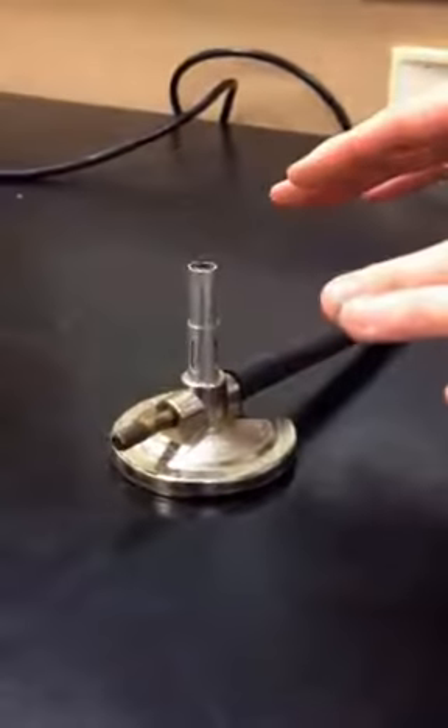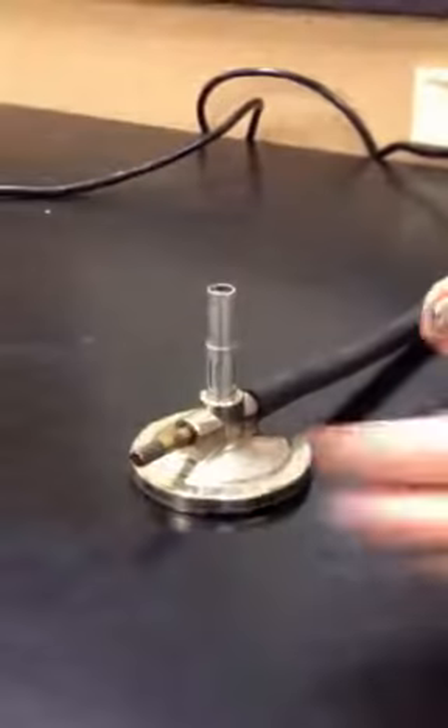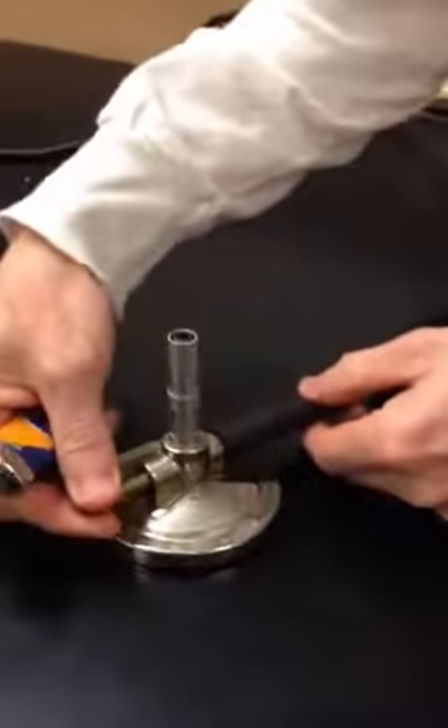When you're using your Bunsen burner, turn it on on the side and listen for gas coming out. If gas comes out, use the on-off knob to go on or off when you hear the gas.